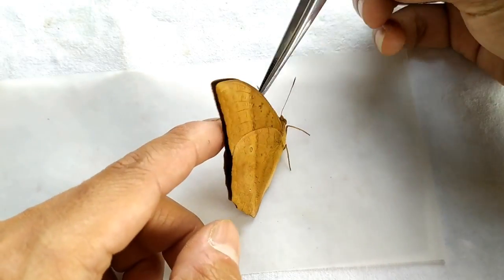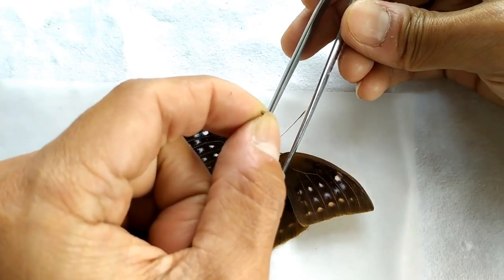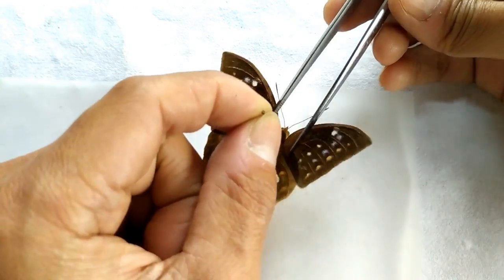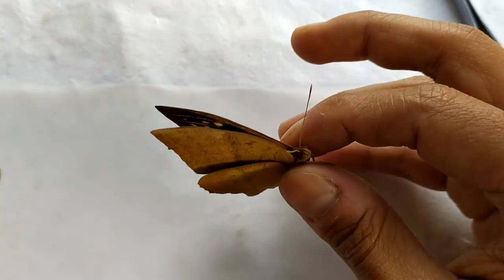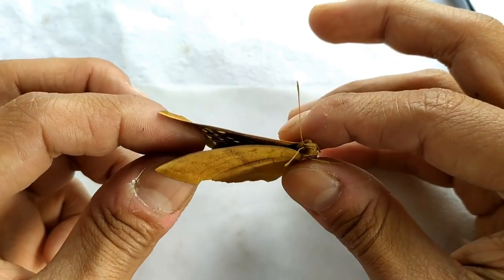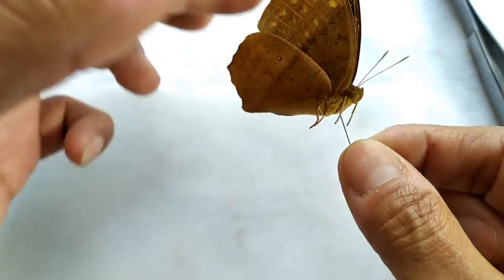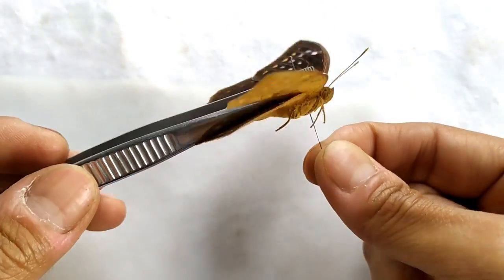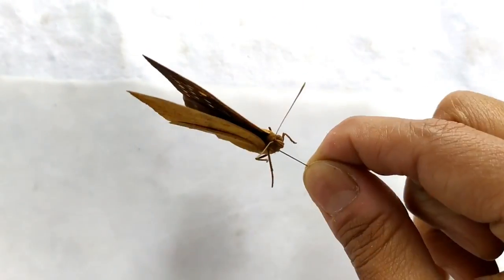To begin the pinning process, take the butterfly specimen. Carefully open the wings using a blunt forcep to avoid damage to the wings. Introduce an insect pin of appropriate size right through the center of the thorax. Make sure that the pin is at a right angle to the specimen plane at all sides. This requires a bit of patience and practice.